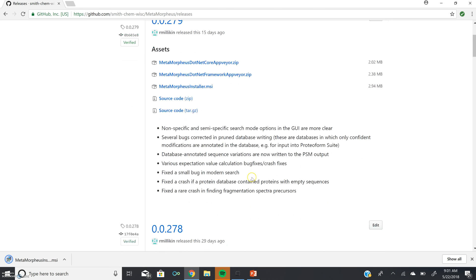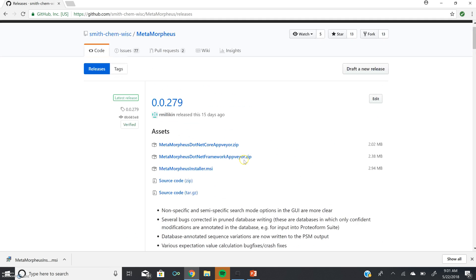You'll notice here this bulleted list, this is the release notes, and these let you know what have been updated in this release of Metamorpheus over previous versions.